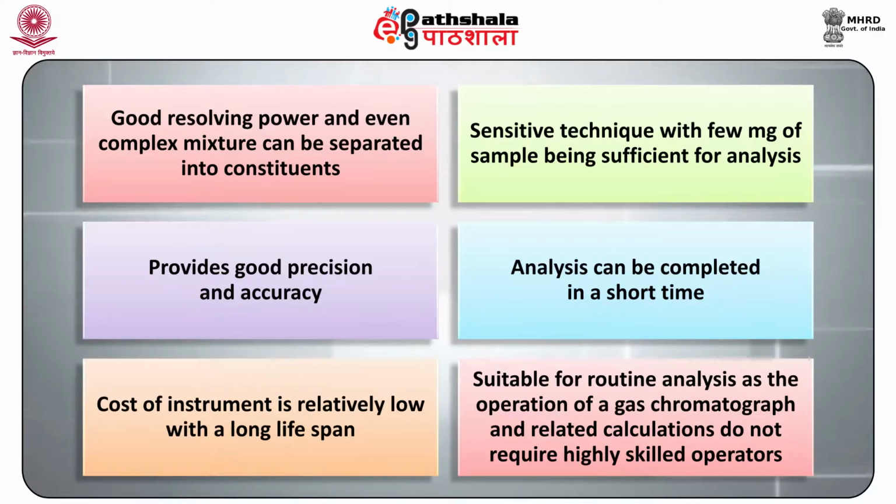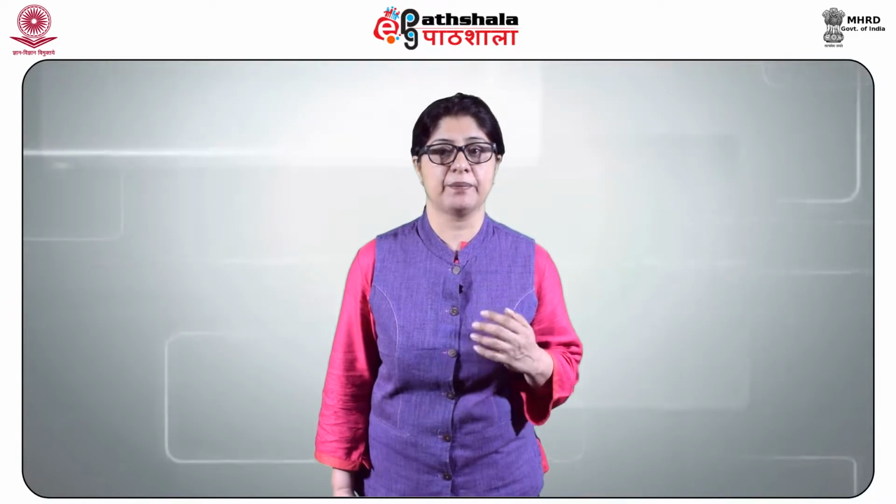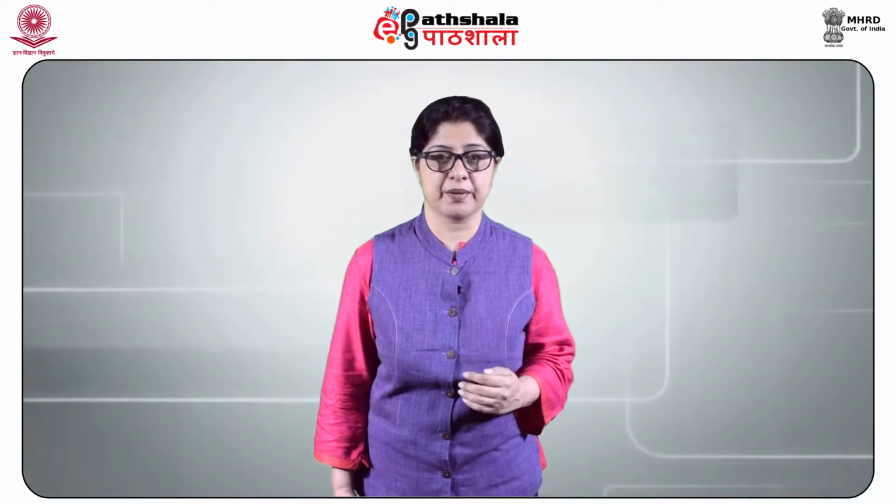The technique is suitable for routine analysis, as the operation of a gas chromatograph and related calculations do not require highly skilled operators. Gas chromatography is at present the most widely used and powerful tool available for separations.